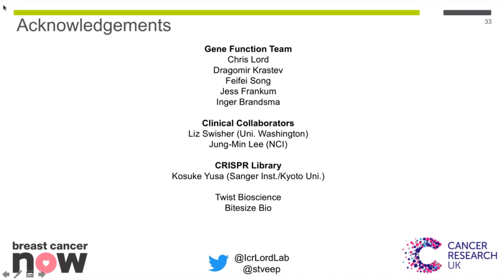But I don't think it is necessarily going to be the case. I mean, you could just filter out your in-frame mutations of interest bioinformatically. Recently, we've also been using some of the CRISPR editing enzymes, which cause missense mutations rather than deletions. And again, in that case, you might be able to get away without.